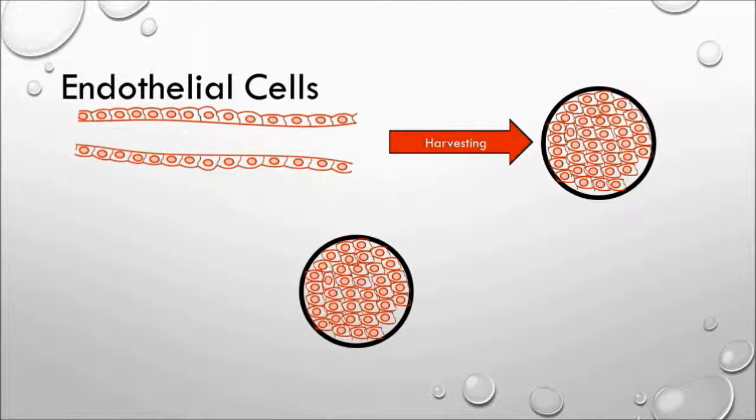We isolate cells from donors and then culture them in plastic dishes and glass cover slips. Using a protein called IL-1 beta, we can then cause the cells to overexpress E-selectin, and after placing the particles into various solutions and perfusing them over a monolayer of activated cells, test the adhesion efficiency. Our aim by culturing these cells and running solution over them is to create the most physiologically relevant model.